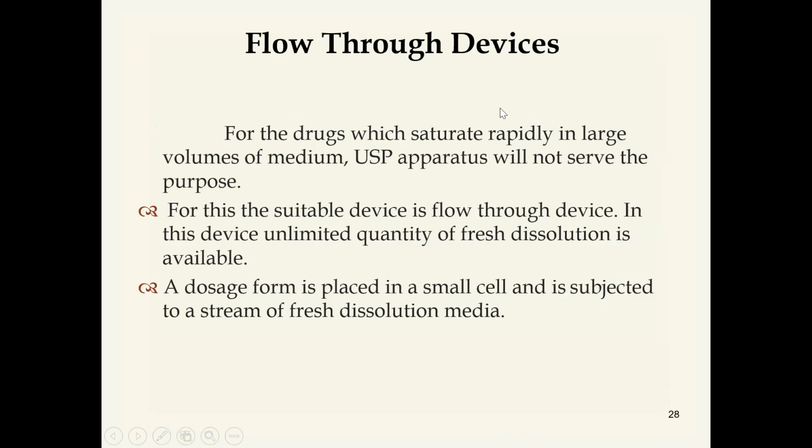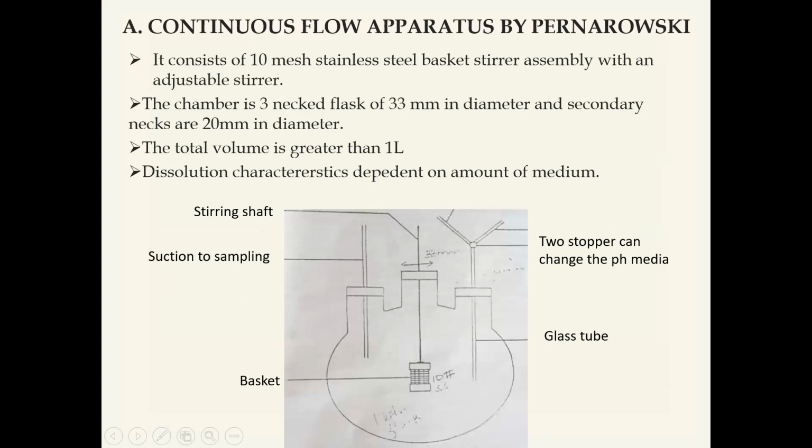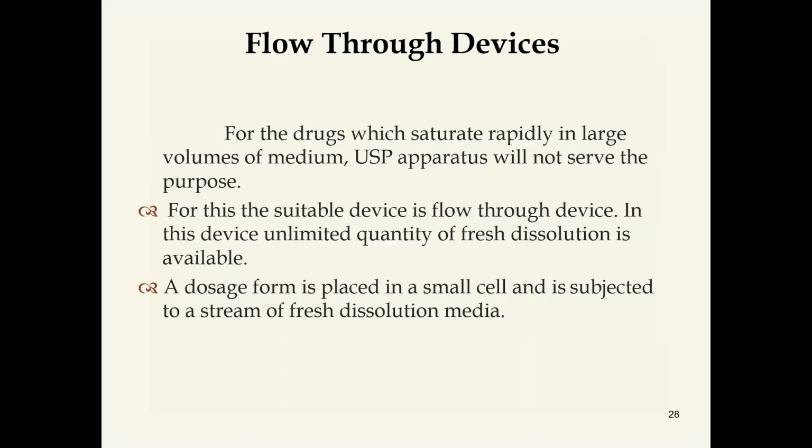Next, flow through devices. Flow through devices are suitable for drugs which saturate rapidly in large volumes of medium.